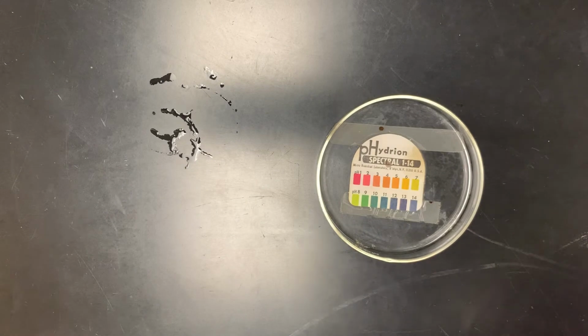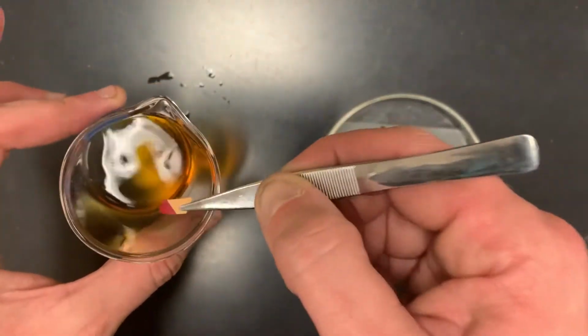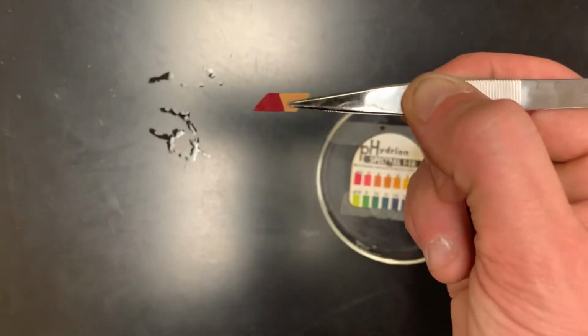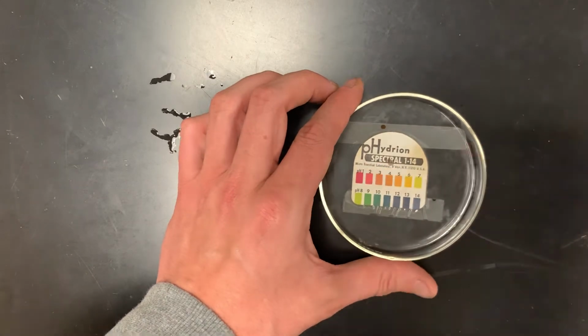Up next, we have our ferric nitrate. So again, nitrate, pretty soluble with just about everything. But we do have the presence of the transition metal there, the iron. Now again, the color of the solution, if you were catching that, is orange, but the pH paper has become this dark red. Wow, this is actually quite acidic. I'd argue maybe between 1 and 2 there.